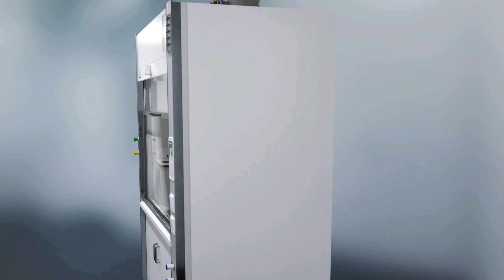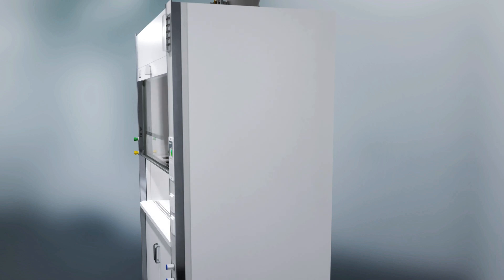For usability reasons, the front contains a large side glass sash on top of the front door.